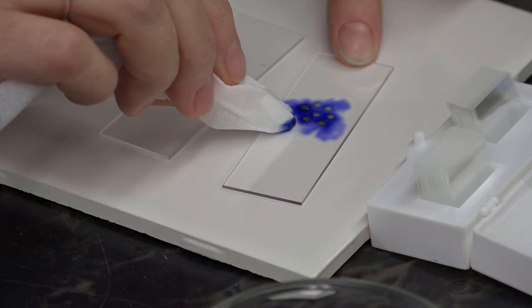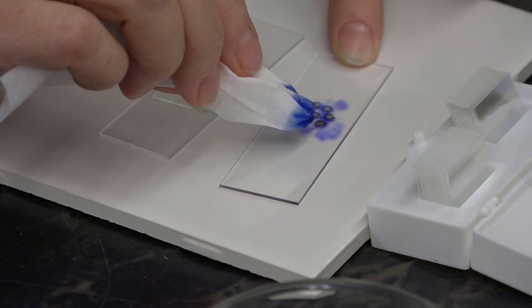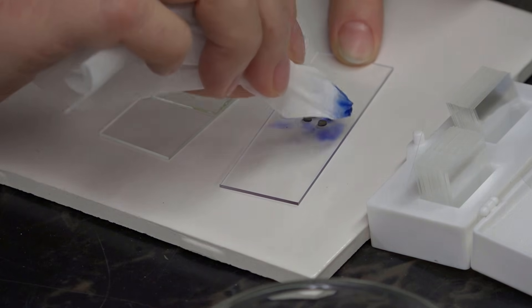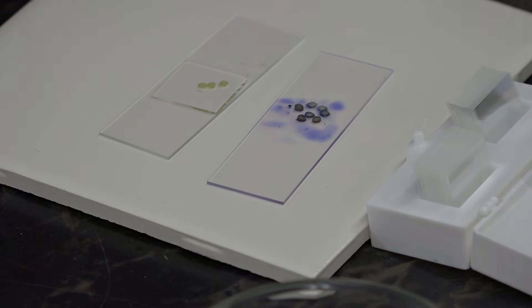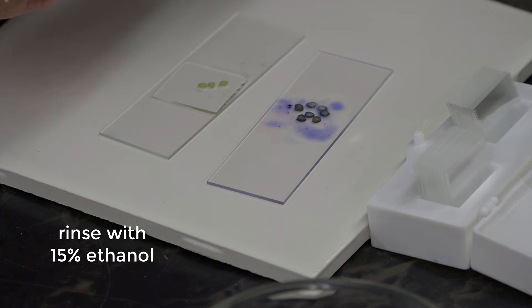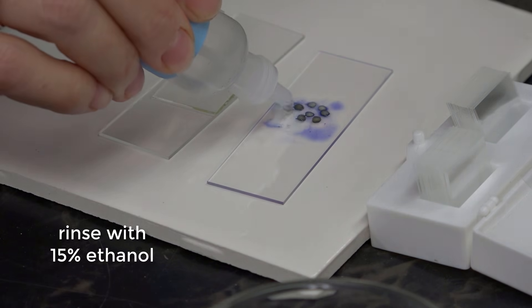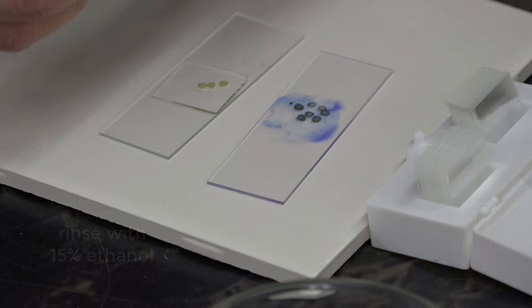Now we're going to draw off the stain. We're going to use 15% ethanol solution to rinse these sections, and that's just going to help us remove some of the excess stain.